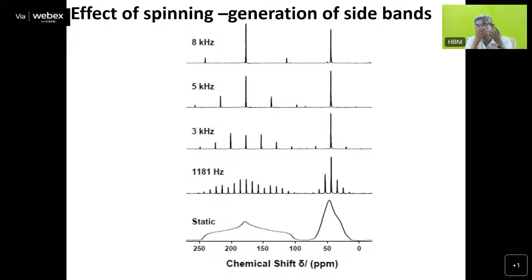If you want more chemical information, then the structural information such as environment, chemical shift anisotropy, etc., you need to forget about that. Otherwise, if you want more about the chemical shift environment or the distribution of the charge density, etc., we need to play a little bit. We have to record the NMR at reduced spinning speeds.